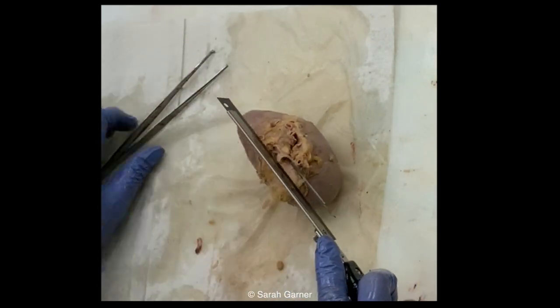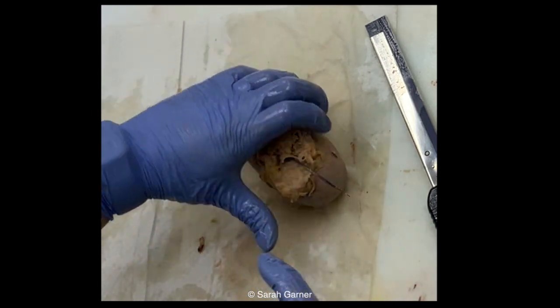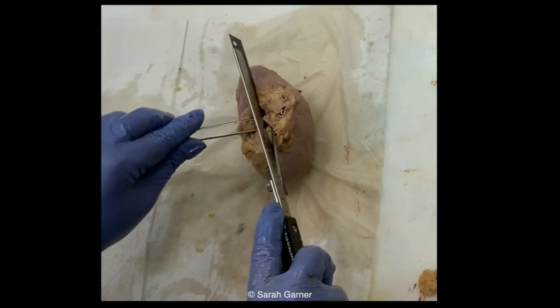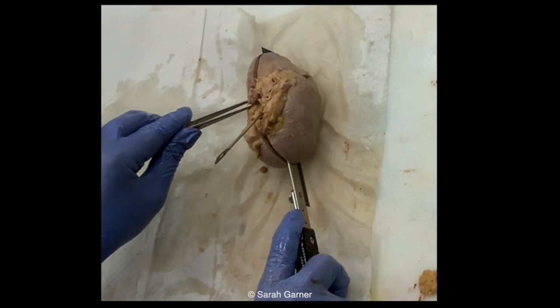So this can be kind of tricky, because especially at autopsy, when you have fresh organs, you do not want to be holding things with your hands. So now you want to cut right along that probe, okay? You should be cutting literally right on the probe. I can feel it.